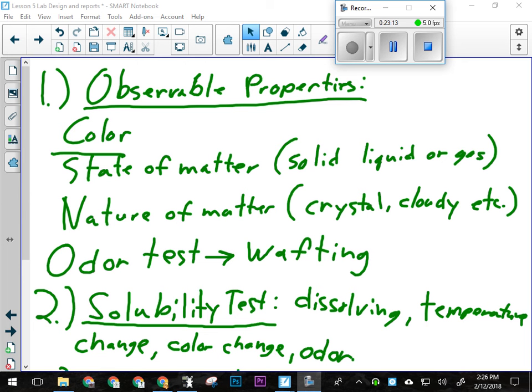What do you think? If you want to dissolve sugar, do you need a fair amount of water? Yeah, okay. You're probably not going to get it all to dissolve, but you can check and see if it's dissolving by just looking carefully. If it's red crystals and the solution turns red, is it dissolving? Yeah, okay. So if it assumes the color of the crystals, it's dissolving. If the crystals shrink, get smaller, then it's dissolving.